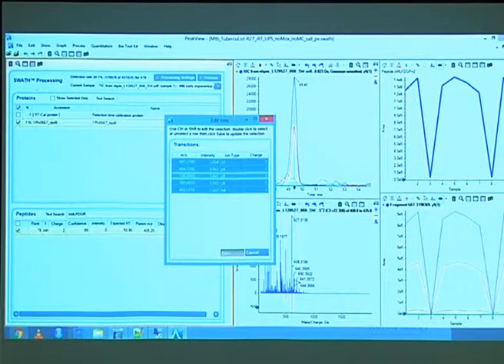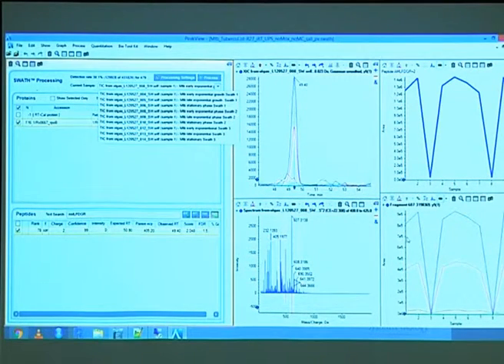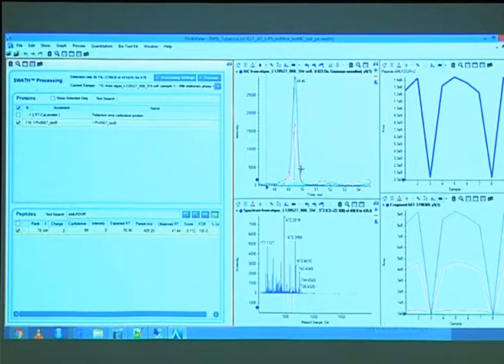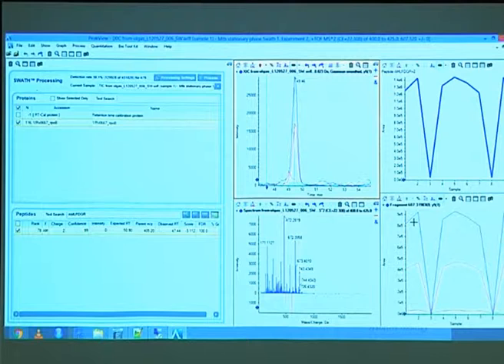And now suddenly it's identified, in that case, I forgot. This is file number 4, so this one here. You see the protein is there, and in that case, it actually thought it's down here, simply because it probably took that one here because the other ions had at least some intensity there, and not barely anything. But yeah, these are just some cases where you might run into problems.